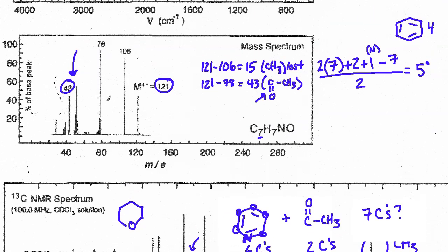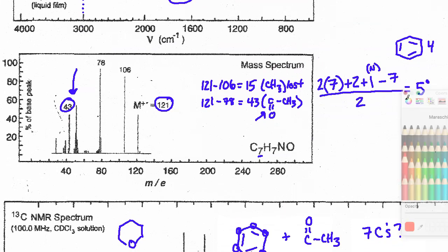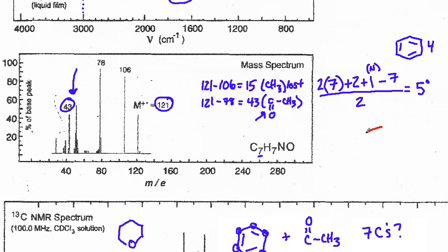All right, so I'm going to just draw this up here conclusively so that everybody knows what the final answer is. Based on the evidence that we have seen here, I probably shouldn't have drawn it like that because I need to put the nitrogen in. So based on what we've seen here, we've got this structure, right? And then my statement would be that we're going to keep this guy meta, so that we can get the proper signal ratios that we want here, because we don't really see that clustering with two groups that are two spaces removed and sort of would cluster up together.